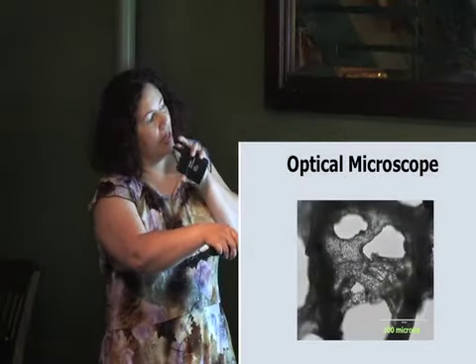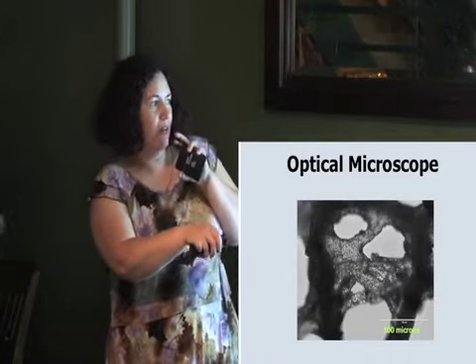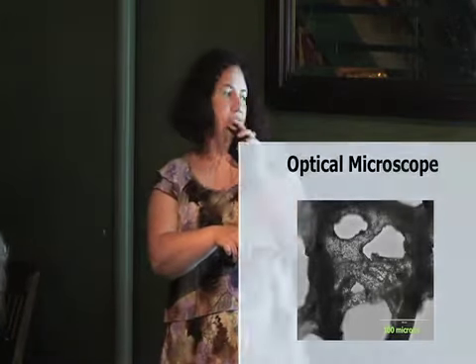And we can see many details like powder particles around here in the veins of this material. If you divide this by 10, they will be about 10 microns, so the size of a red blood cell. And here we are getting closer to the limit of this optical microscope. But we can get details that we don't usually see by naked eye.